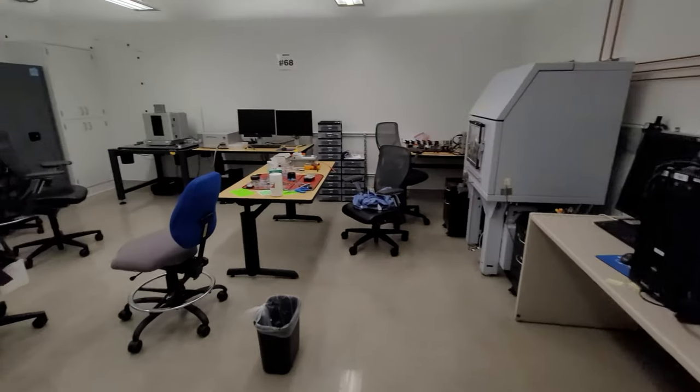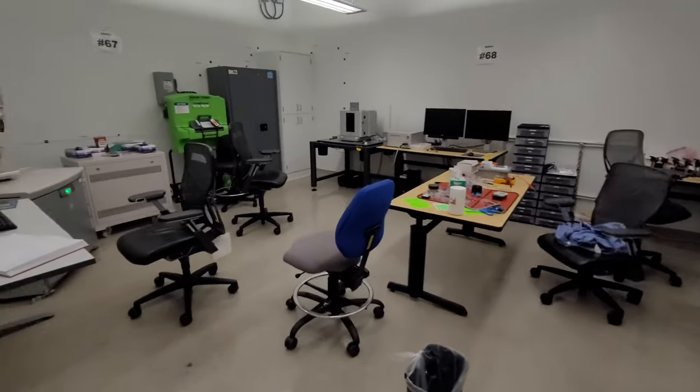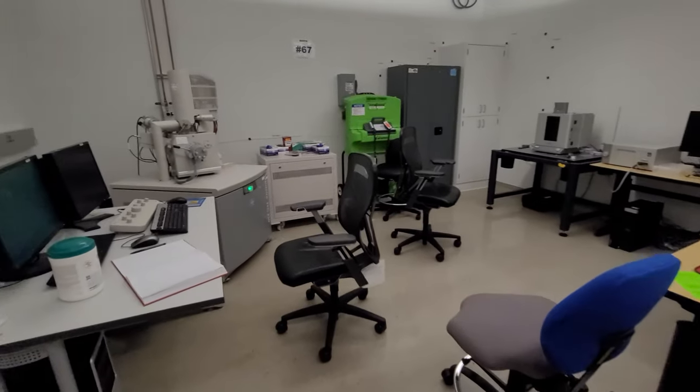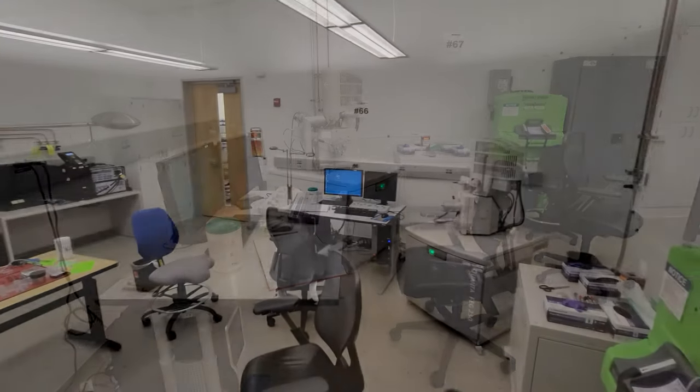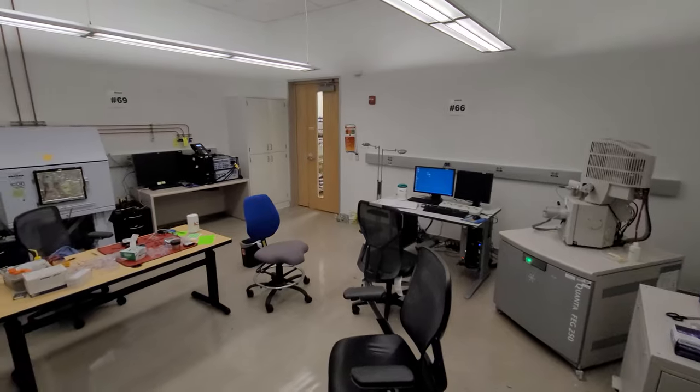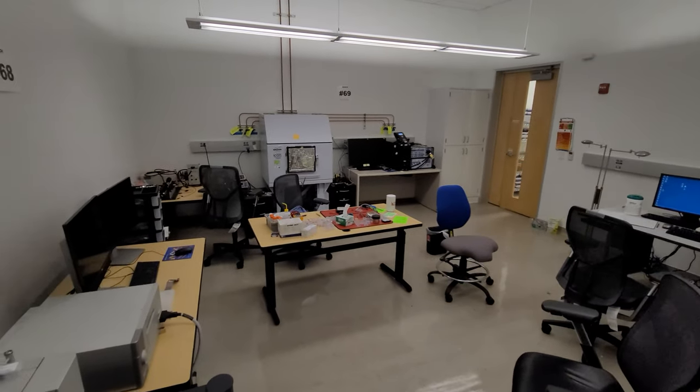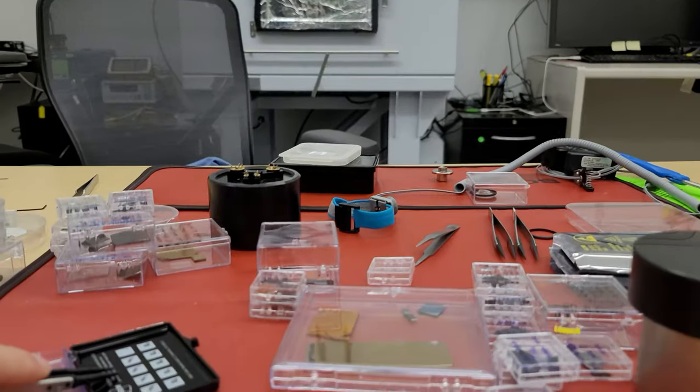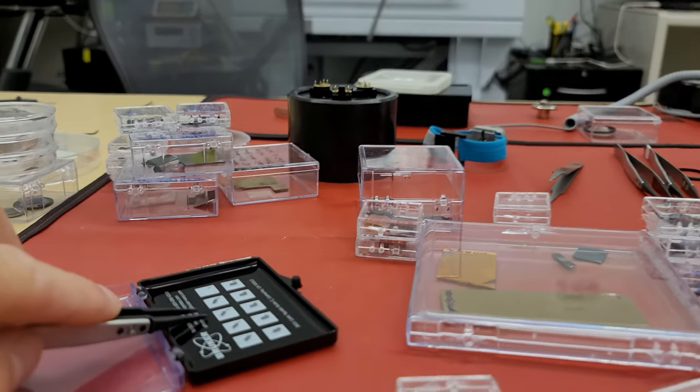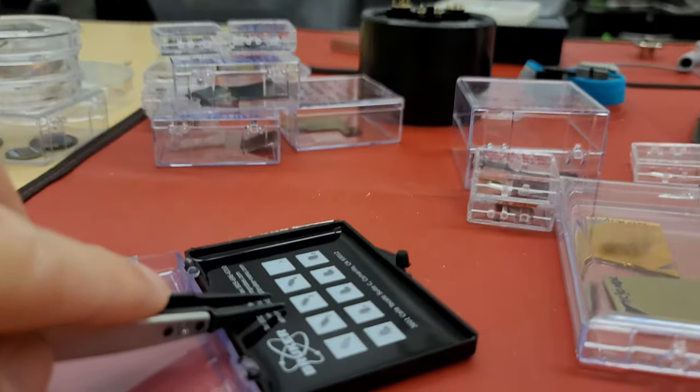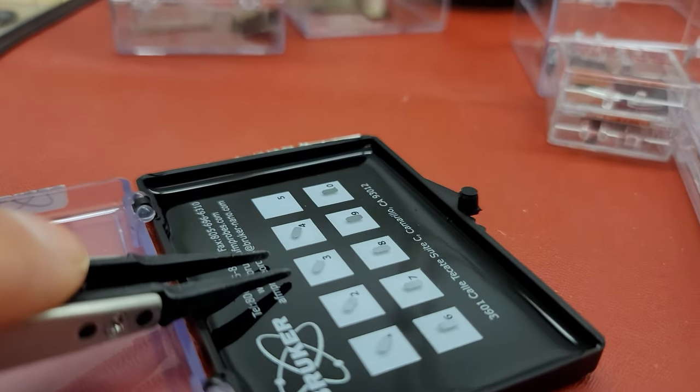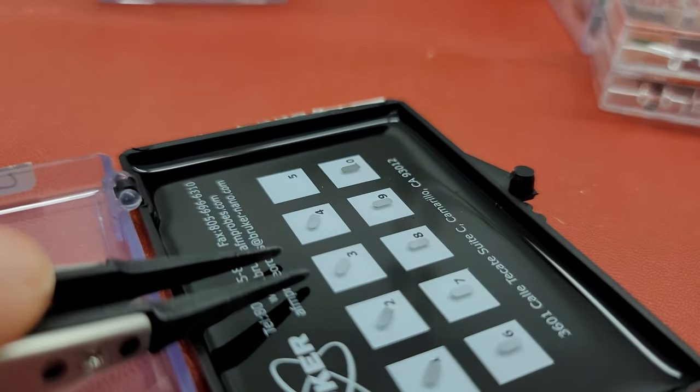Moving into the microscopy lab, the combination of atomic force microscopy, AFM, and scanning electron microscopy, SEM, enables the nanometer scale imaging of surface topography, morphology, and elemental composition mapping. AFM uses a cantilever with an atomically sharp point to engage the sample surface, and by precisely rastering the tip, the deflection caused by the sample topography is measured. The resulting images offer a unique perspective on the grain structure of semiconductors and catalysts.